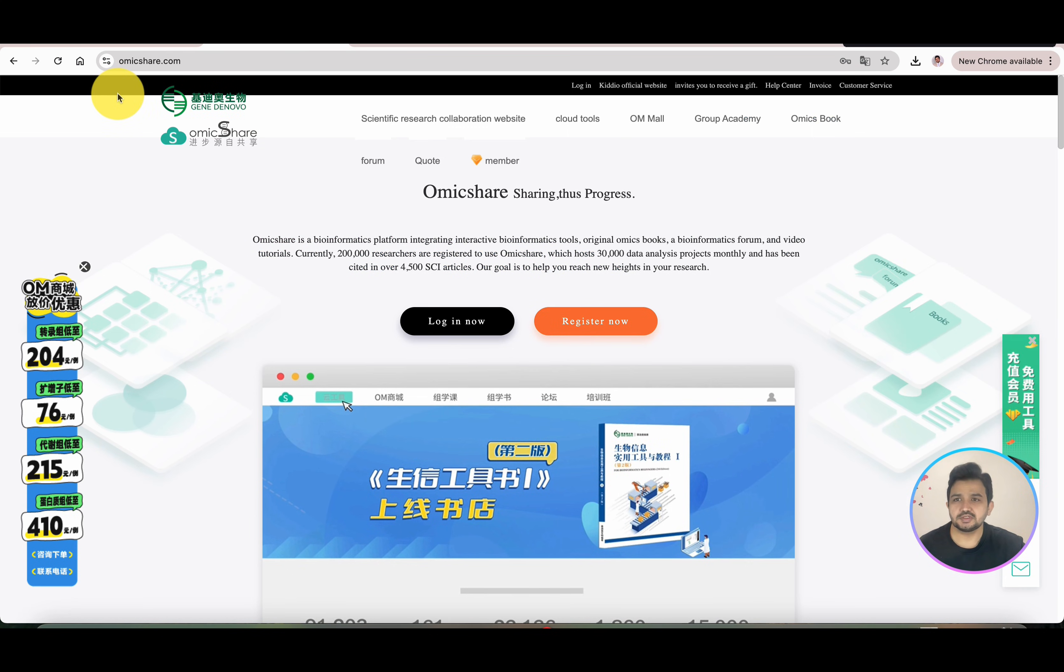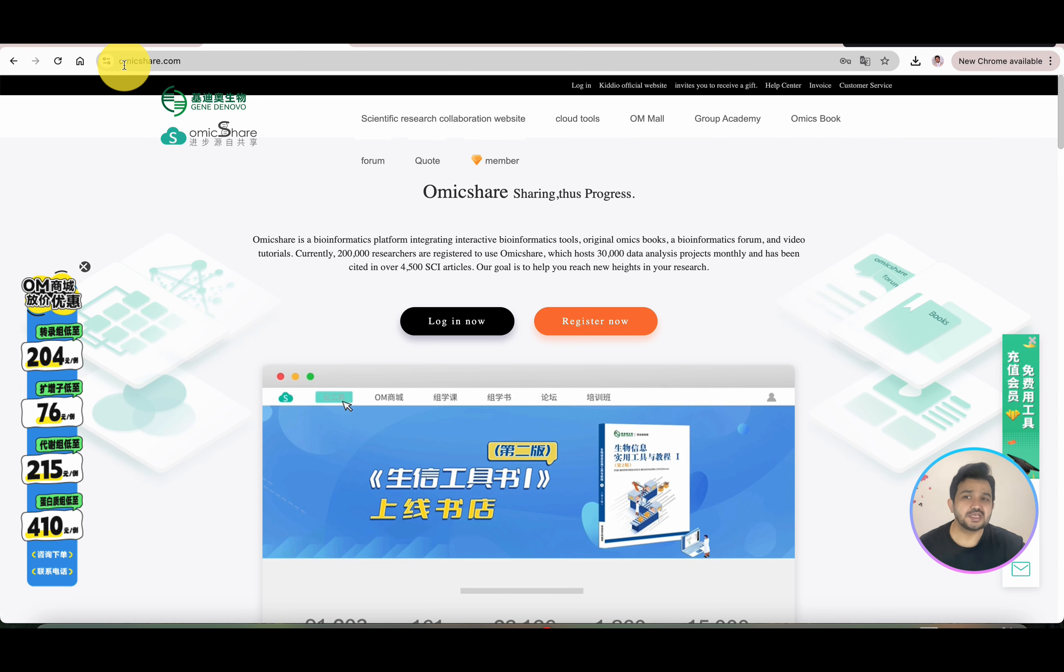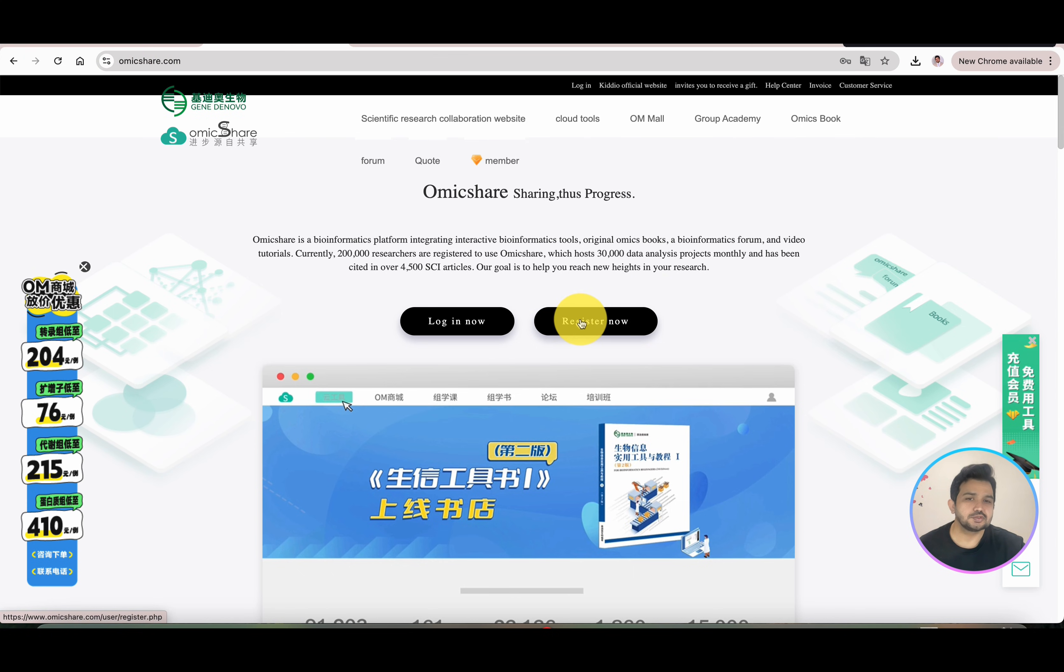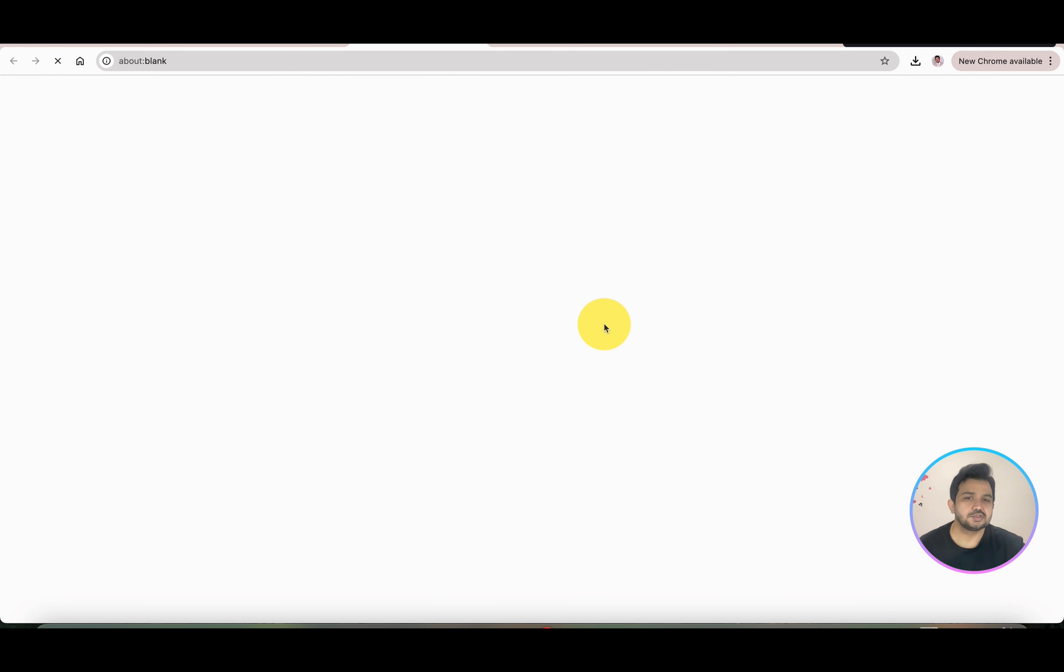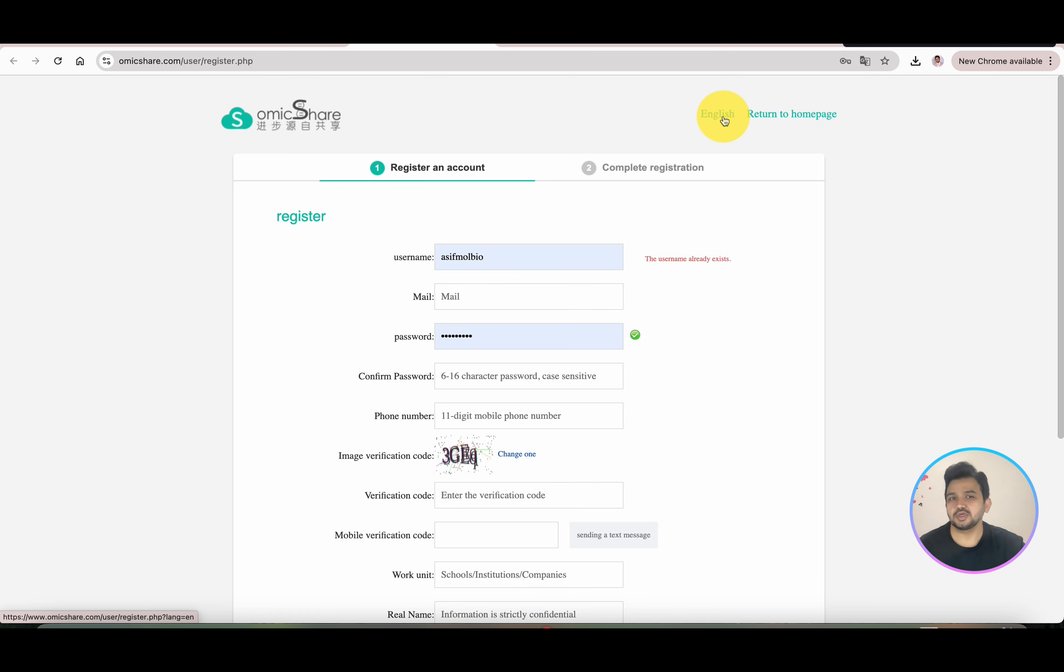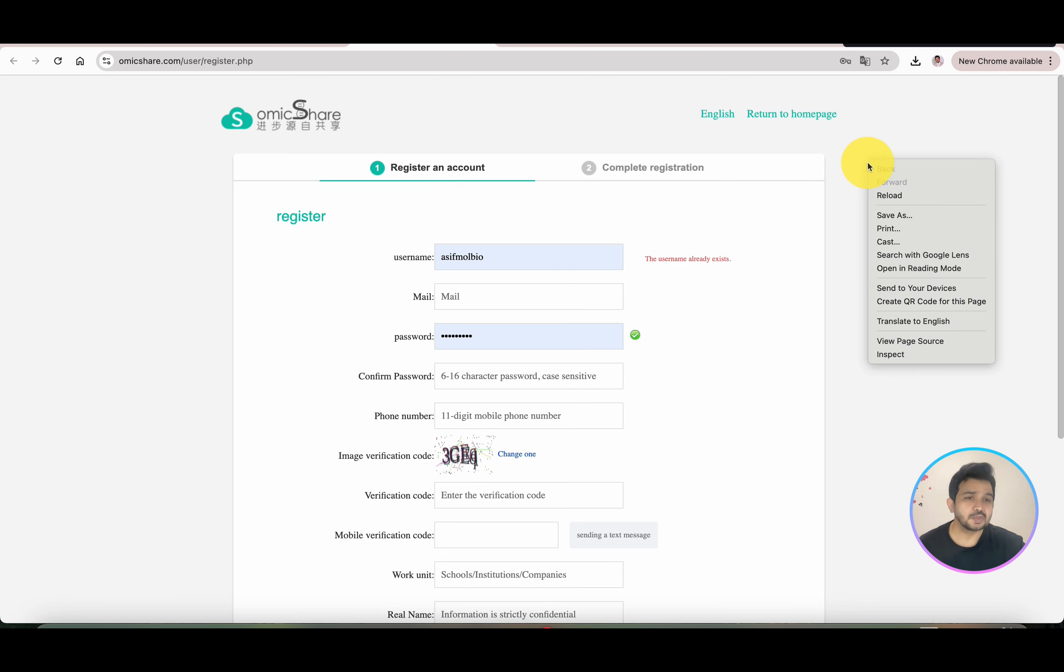This is the interface of the OmicsShare database and its URL is omicshare.com. If you're a new user, you can simply click on Register Now. When you click, it will give you an option in English if you're an English user, or if you understand Chinese you can use it directly. You can also right-click and translate the page into English.